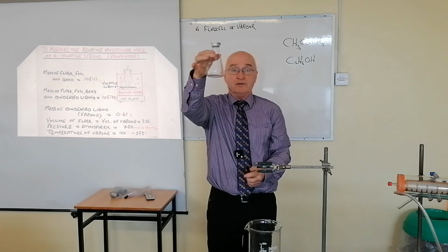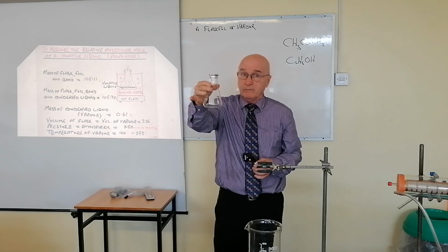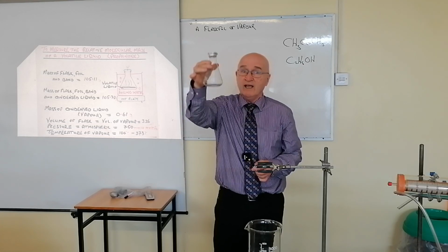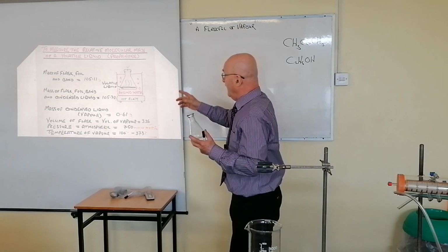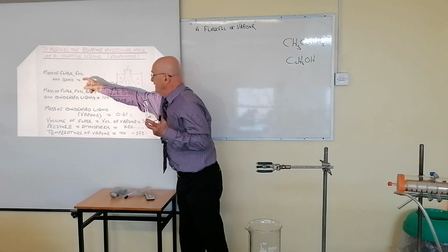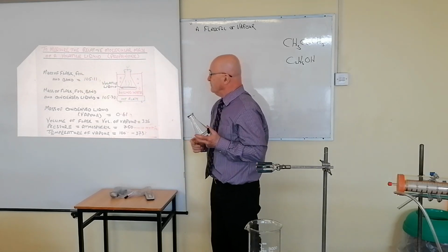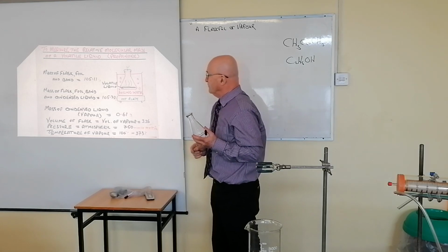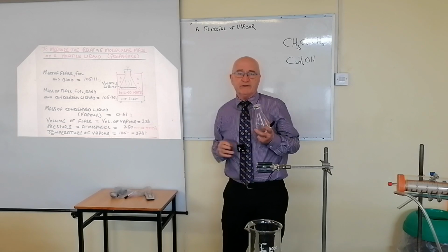Okay, so I literally weigh that on a laboratory balance. Ideally, a 4 decimal place balance will settle for 2 decimal places. You weigh the empty flask. Have you got that? That's what you do. That's the initial thing. And there you are. The mass of the flask, the tin foil, and the elastic band for this experiment came out to be 105.11 grams. Okay, fine. That's a recorded value. They'll probably give you that on the paper.